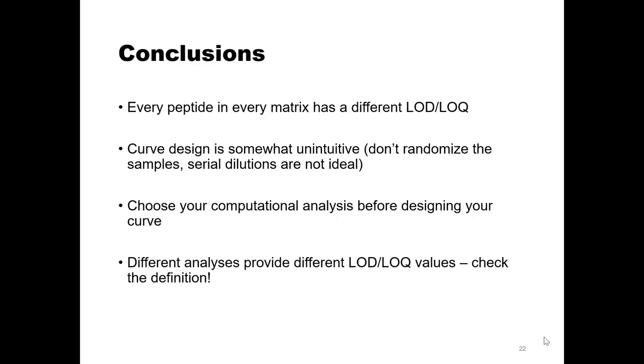Sue has a comment. Just because a method can calculate LOD and LOQ doesn't necessarily mean that whatever method provides a true estimate of noise. Yes, that's a great point. I'm not saying anyone here, but I have encountered scientists who have selected the method of LOD calculation to reflect the best sensitivity of their assay.